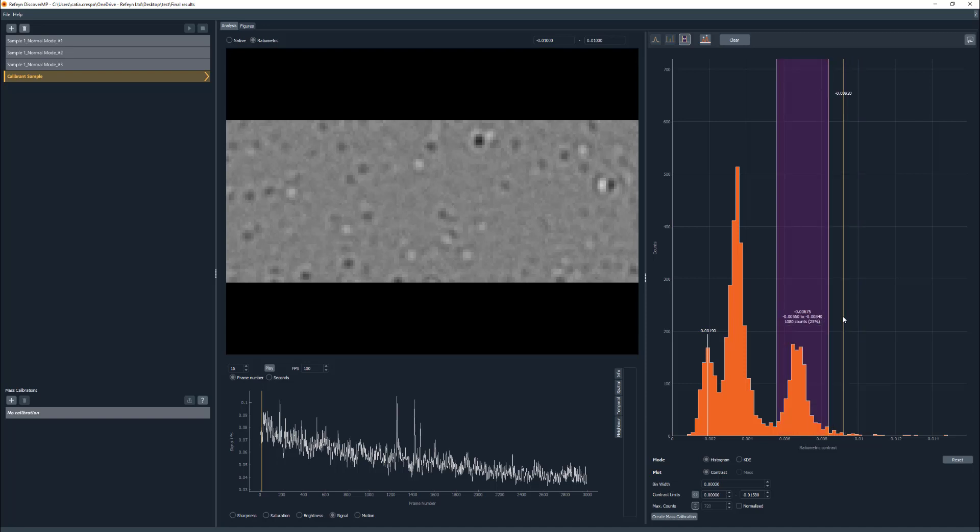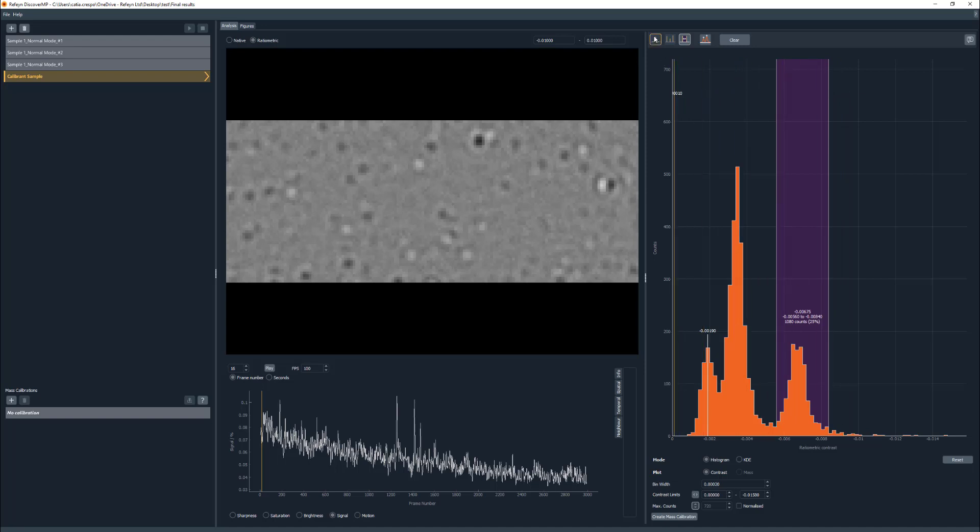As you can see, the region of interest is highlighted in purple, and the label has appeared with three pieces of information: the center point for the region selected, the interval for the region that was made, and the total number of counts. The number of counts has a percentage of the counts currently visible in the histogram.